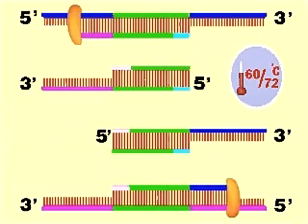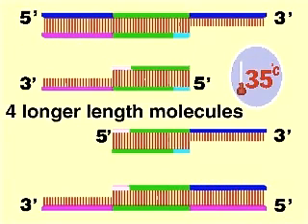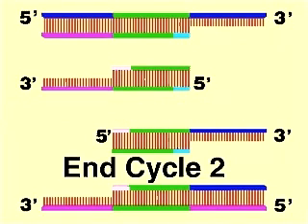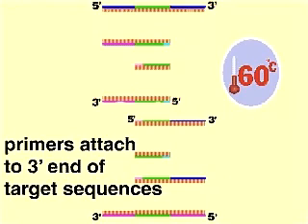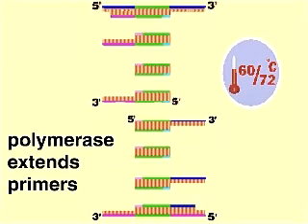At the end of cycle 2, 4 partially double-stranded molecules are produced. All contain the target sequence plus some adjacent DNA. During the third cycle, the DNA strands are again melted. The primers hybridize to the target sequence, and the Taq polymerase synthesizes complementary DNA strands.